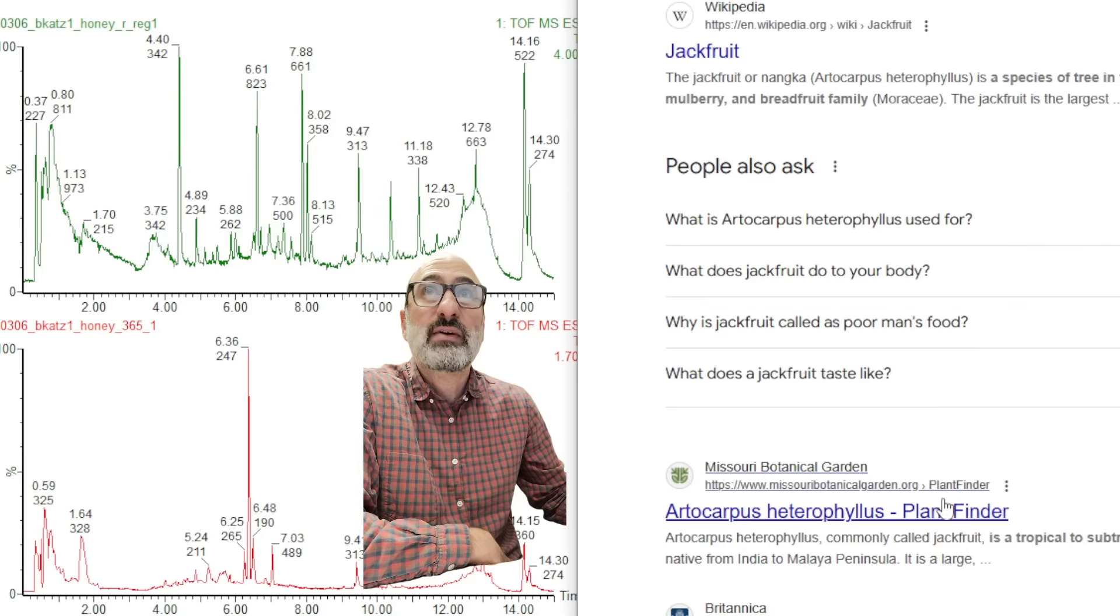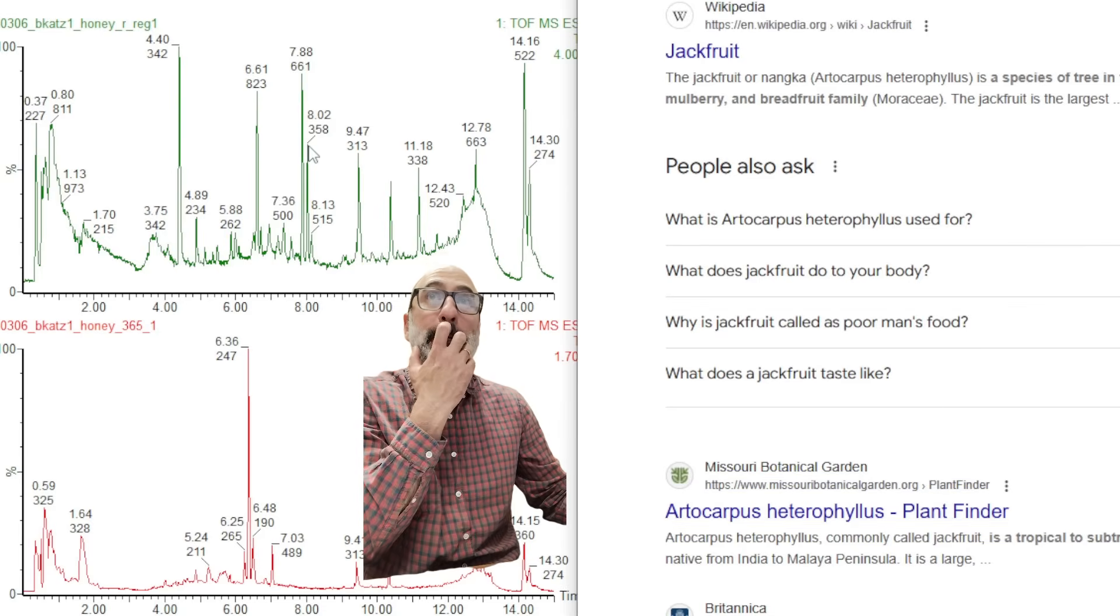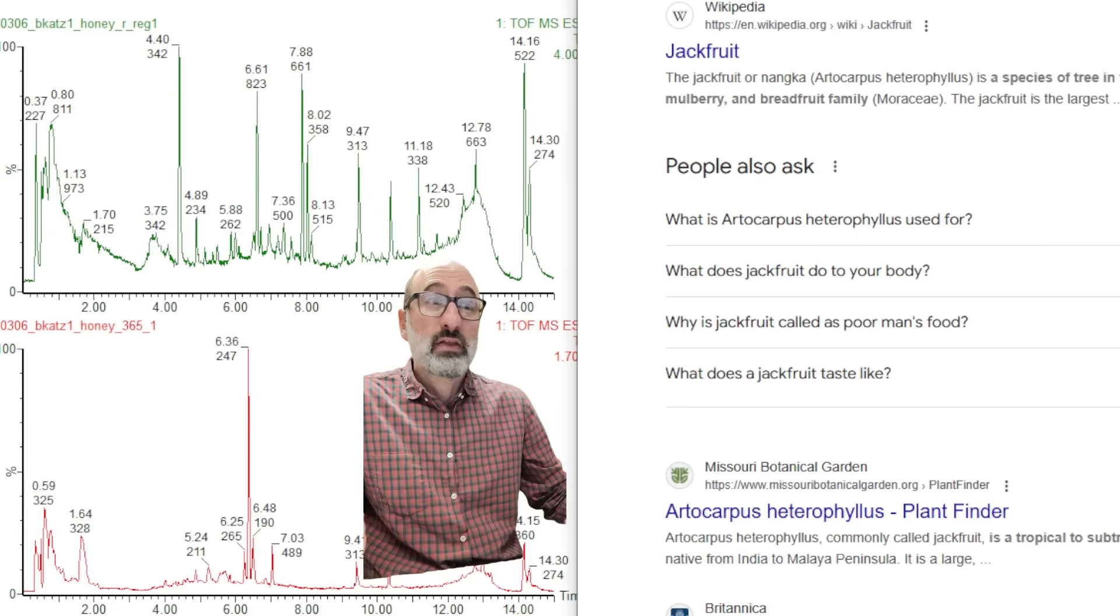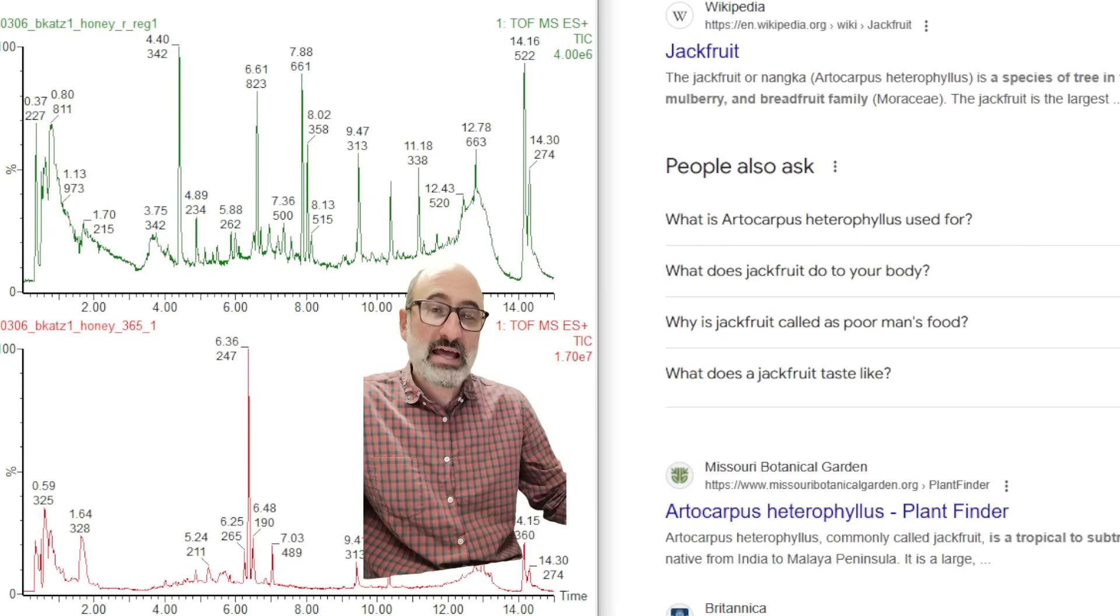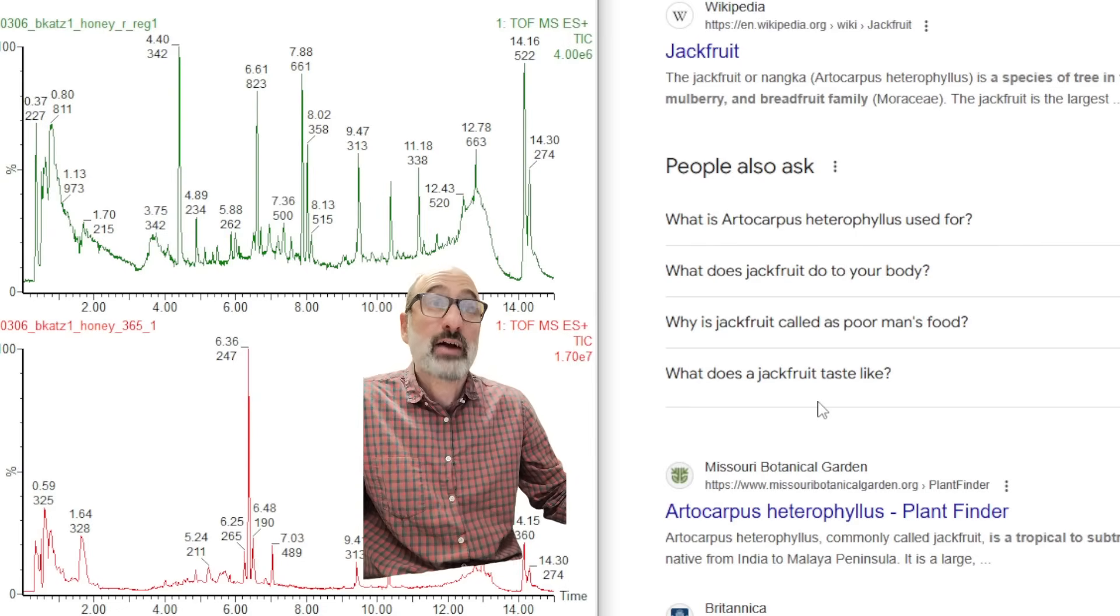But, anyways, the rest of the stuff I'm really not getting good hits for. This 358, this 661. I don't know. But, anyways, the other thing that people are asking about this Royal Honey is, does it just have, like, Viagra in it?